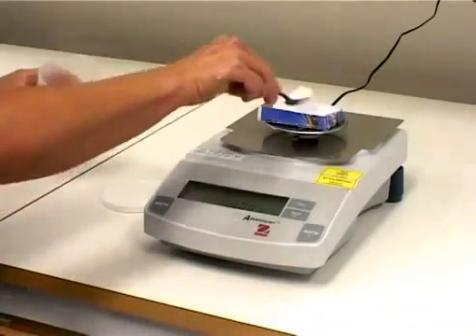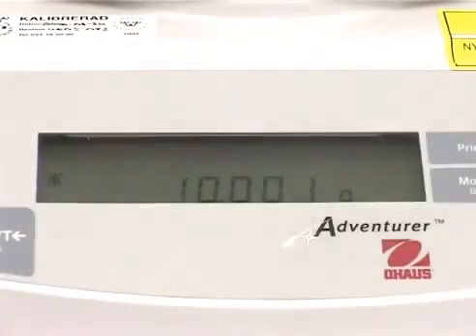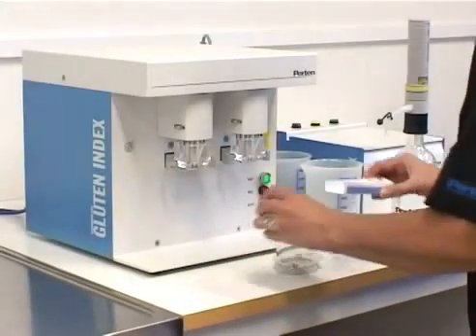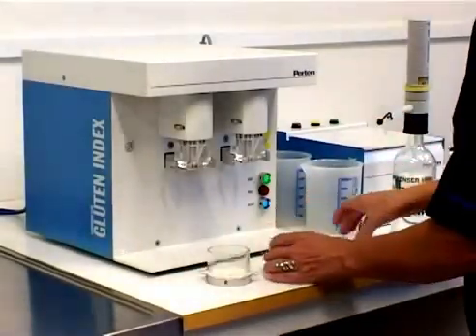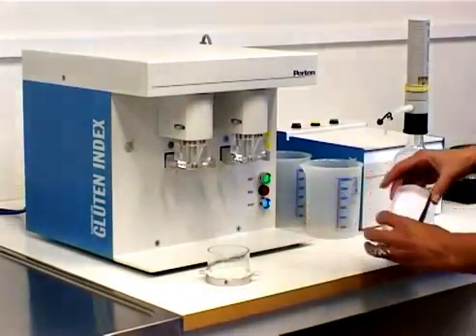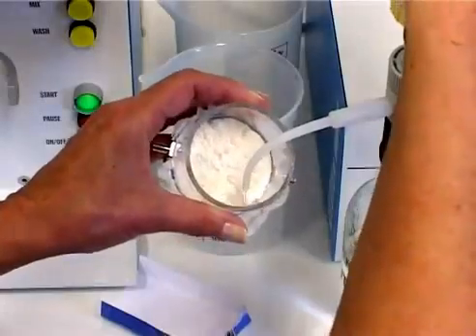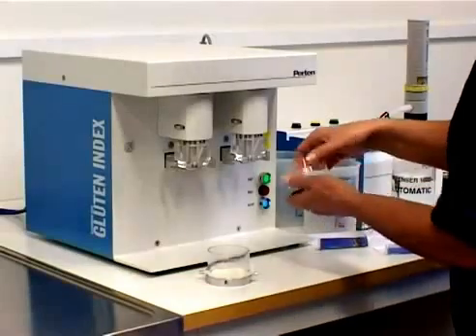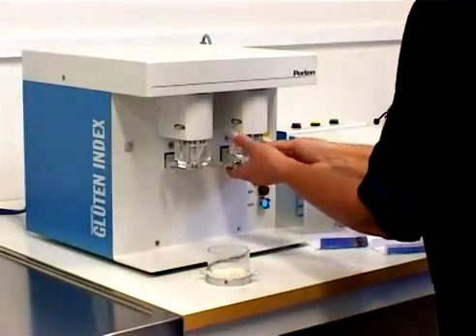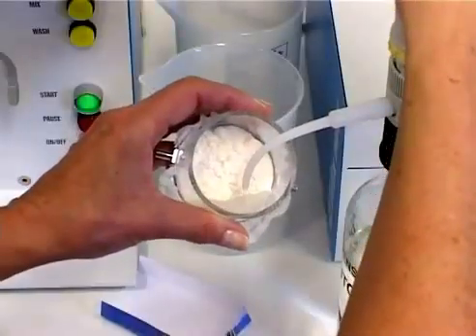Weigh the 10 gram sample accurately to the second decimal. Put the sample into the wash chamber and spread evenly over the sieve. Add 4.8 ml sodium chloride solution using the dispenser. Pour the solution carefully along the side of the wash chamber and shake to ensure the entire surface is covered.